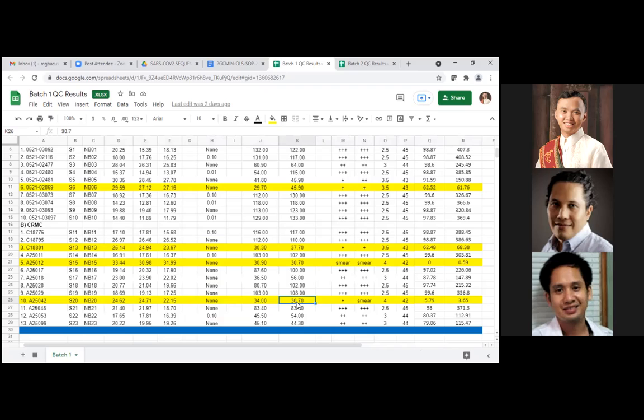Yeah, it's difficult to troubleshoot this because this could be a case of RNA degradation. But when you have RNA degradation, notice that your diagnostic tests will still pick up the RNA because the markers are very specific, like the S gene, the N gene.